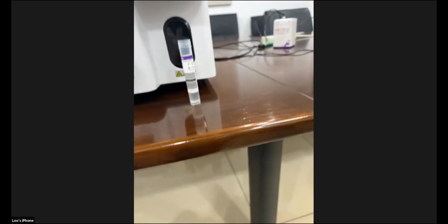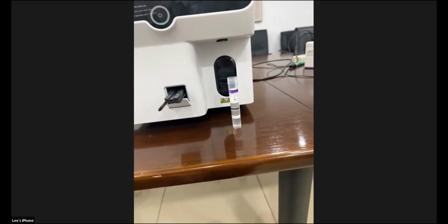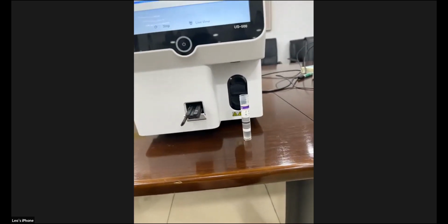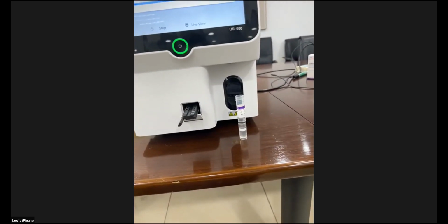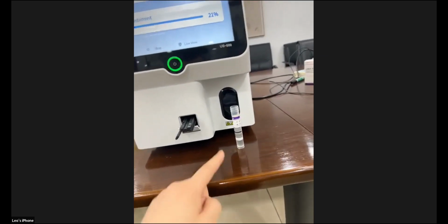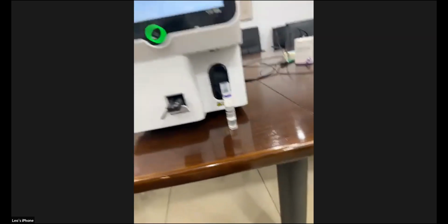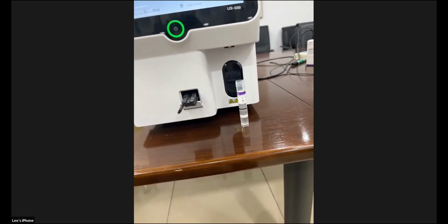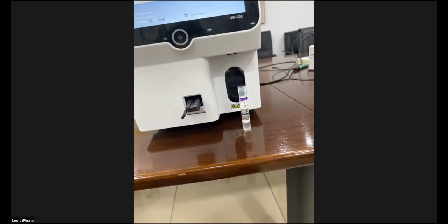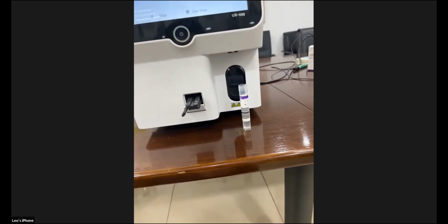It will be another solution if you cannot mix the samples well, because most of the material and the cells will go into the bottom of the tube if you leave the sample for a few minutes, a few seconds, or a few hours. So I think it's another solution for your situation.